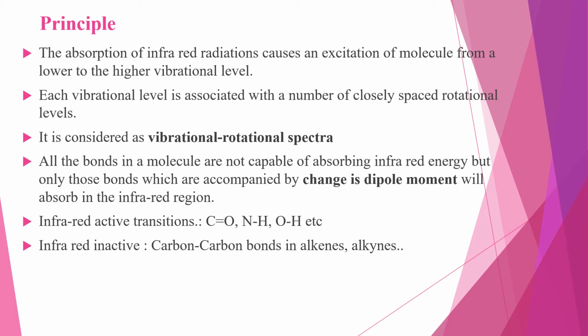For example, vibrational transitions of C=O, N-H, O-H, etc. bonds are accompanied by a change in dipole moment and so absorb strongly in the infrared region. But transitions in carbon-carbon bonds in symmetrical alkynes are not accompanied by a change in dipole moment and hence do not absorb in the infrared region.